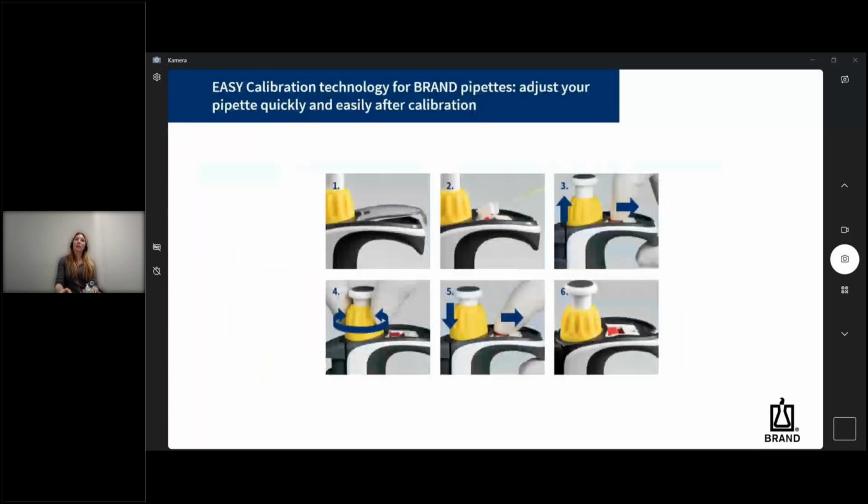If the leak test, which is performed in connection with the calibration, does not reveal any errors, and technique, handling, and ambient conditions can be excluded as the cause of error, the pipette must be adjusted. In most systems on the market, an adjustment involves correcting the piston stroke length. The disadvantage of this procedure is that a careful approach must be taken, and as a result, readjustment may be required in a further step. In addition, a tool is usually required.